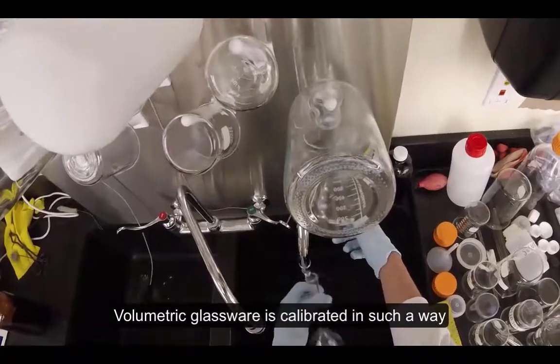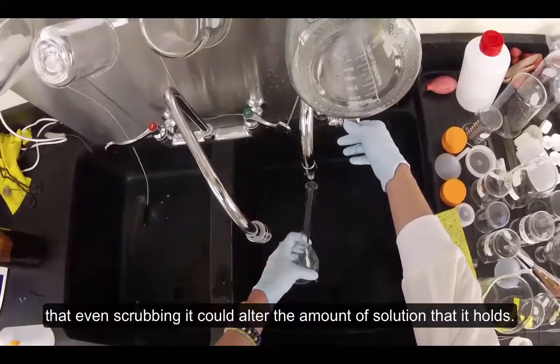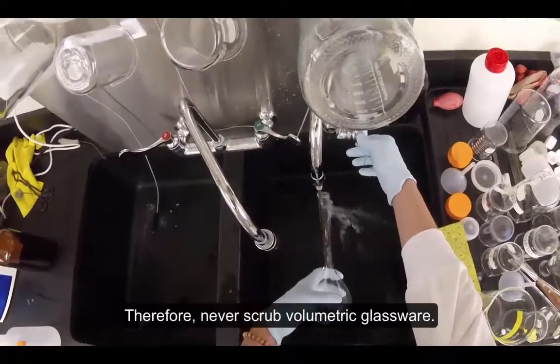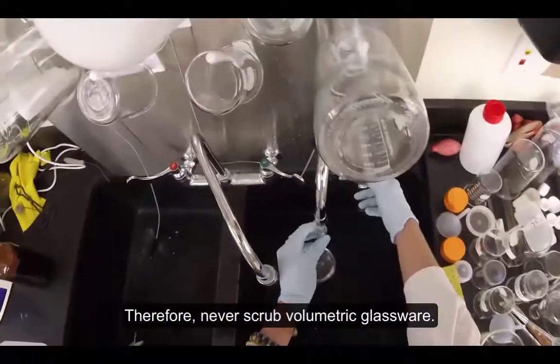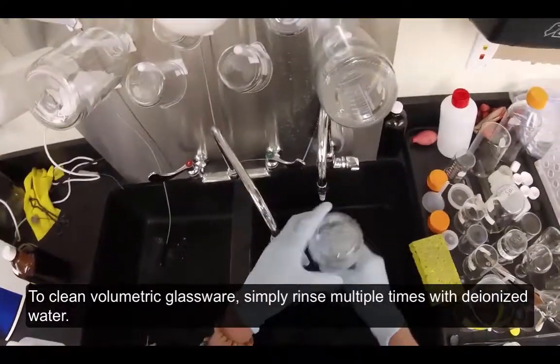Volumetric glassware is calibrated in such a way that even scrubbing it could alter the amount of solution that it holds. Therefore, never scrub volumetric glassware. To clean volumetric glassware, simply rinse multiple times with deionized water.